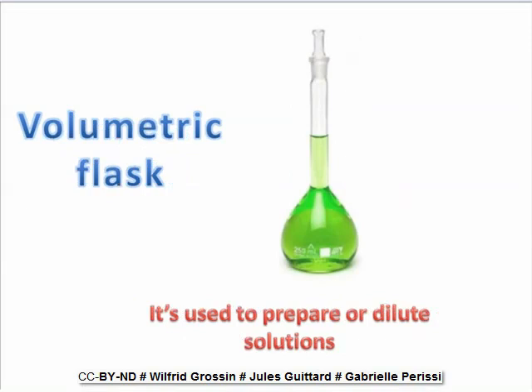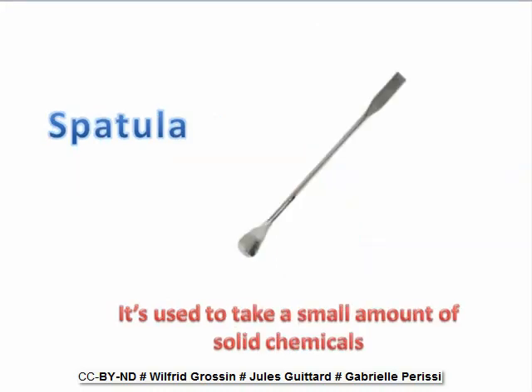Volumetric flask. It's used to prepare or dilute solutions. Spatula. It's used to take a small amount of solid chemicals.